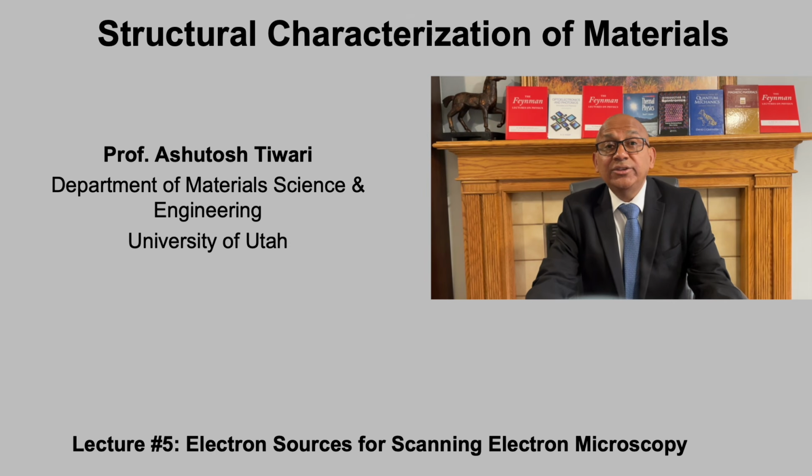This lecture focuses on how electrons are generated, the physical mechanism behind different types of electron sources, and why the choice of source matters for imaging performance.